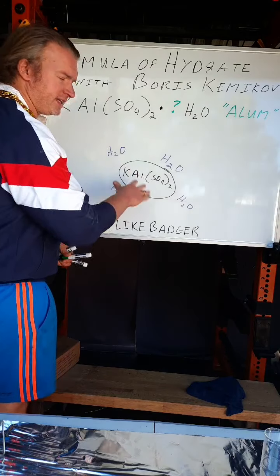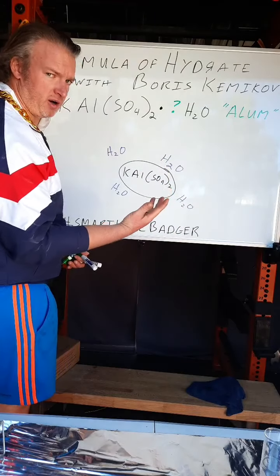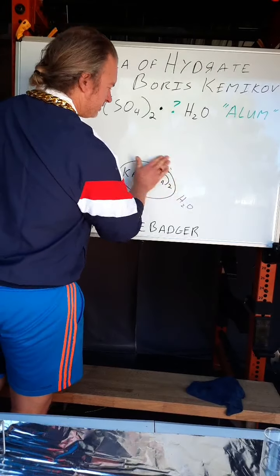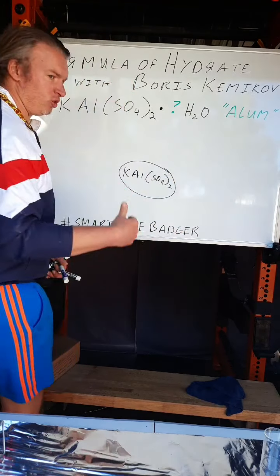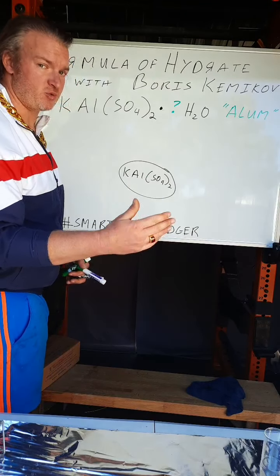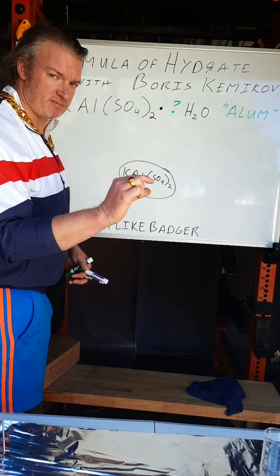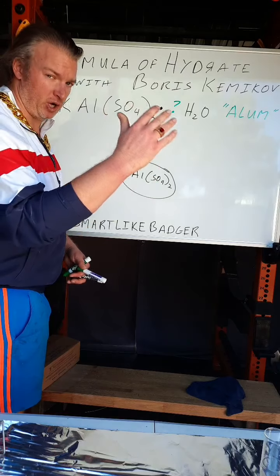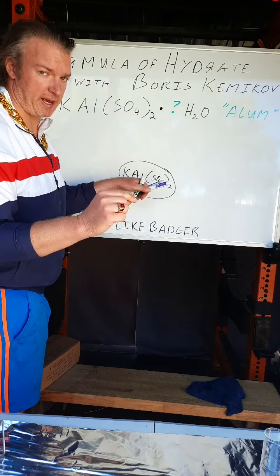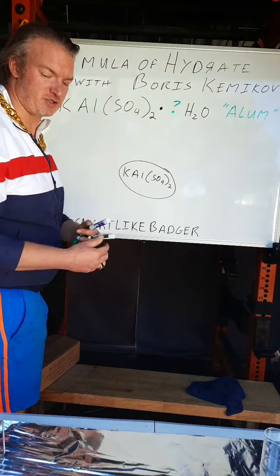We will take a sample, we will heat this sample and boil off these waters. So when the waters are boiled off from heat, we will reweigh the sample. The sample will be lighter because we heated away the waters. We will know how many grams of waters were boiled off, and we will know how many grams of this is dry. Come, let us do the experiment and do some math. You'll like and enjoy.